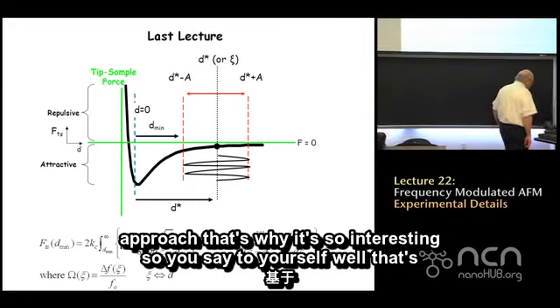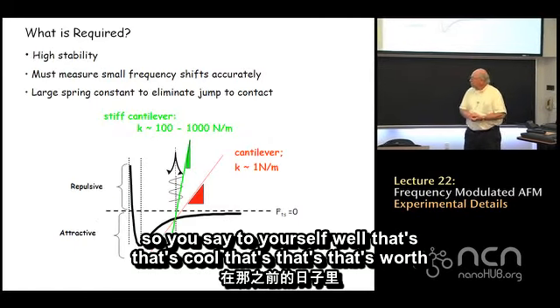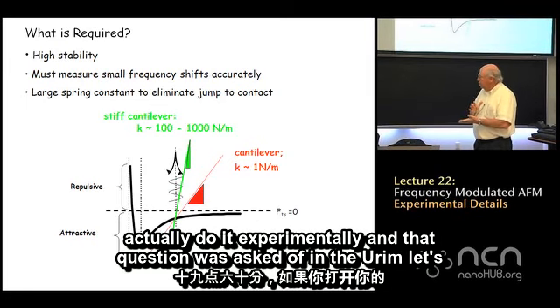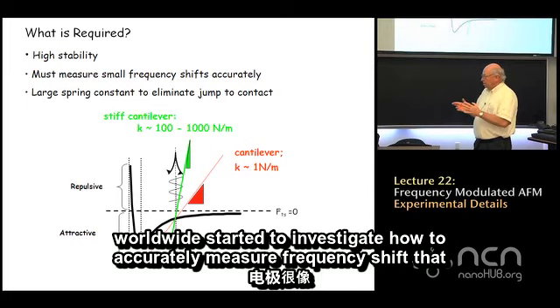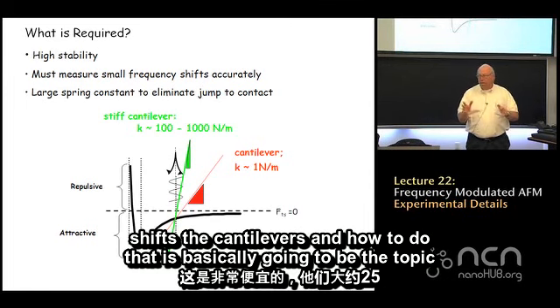So you say to yourself, well, that's cool, that's worth doing. The question is, how do you actually do it experimentally? And that question was asked in, let's say, the mid-1990s, and a variety of groups worldwide started to investigate how to accurately measure the frequency shifts of cantilevers, and how to do that is basically going to be the topic of the lecture today.